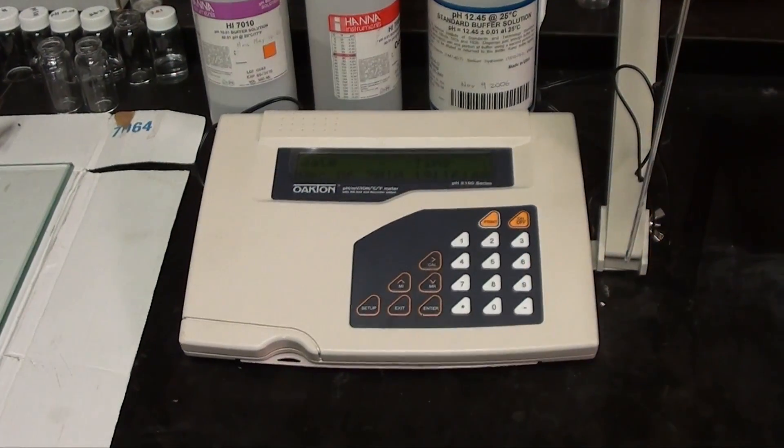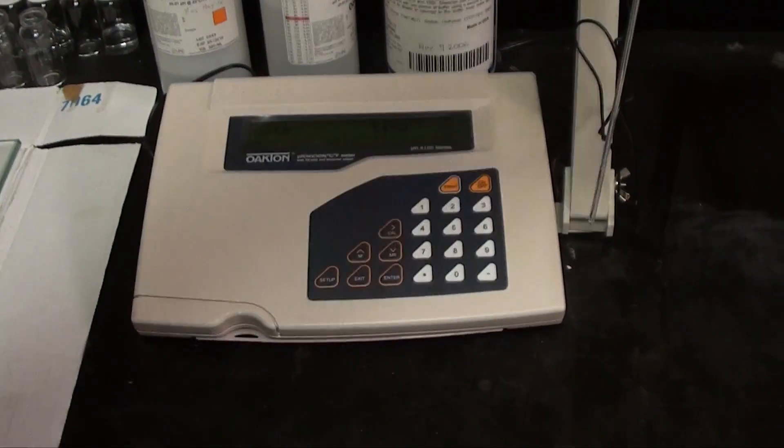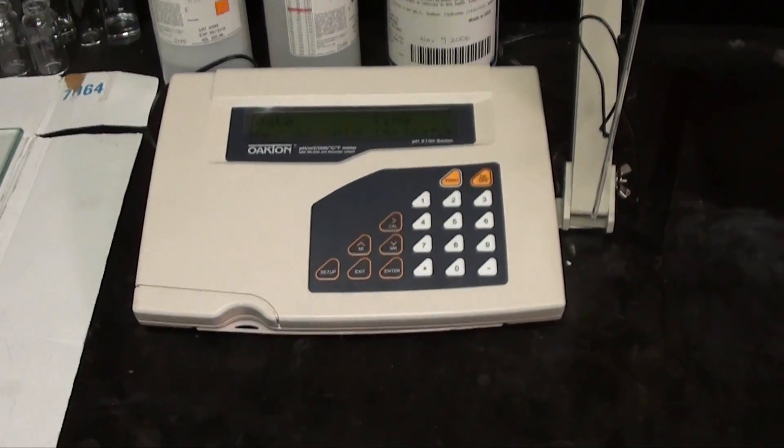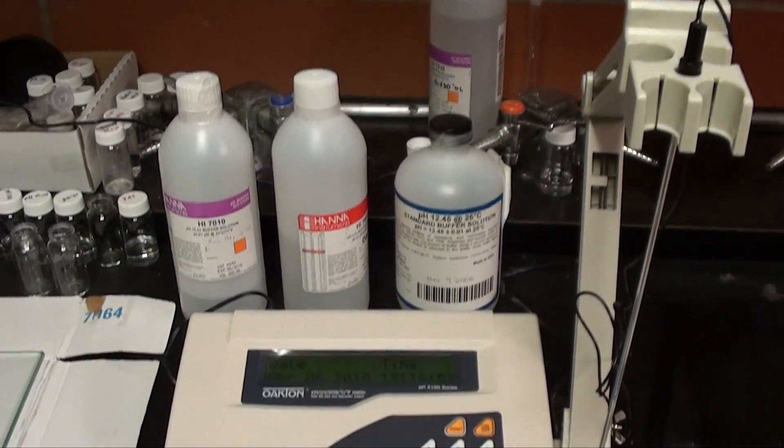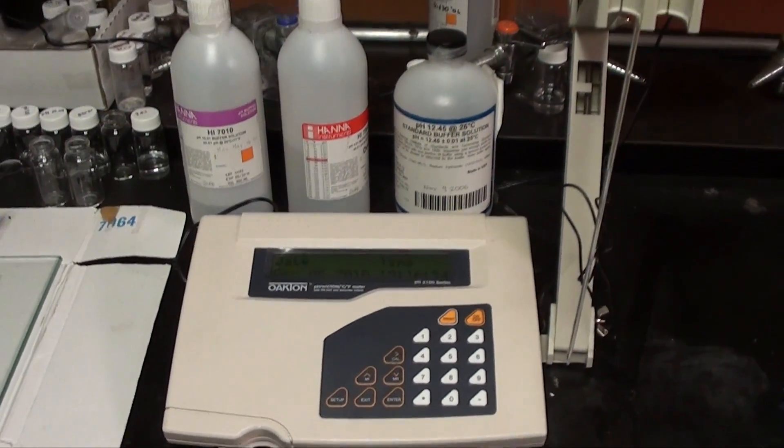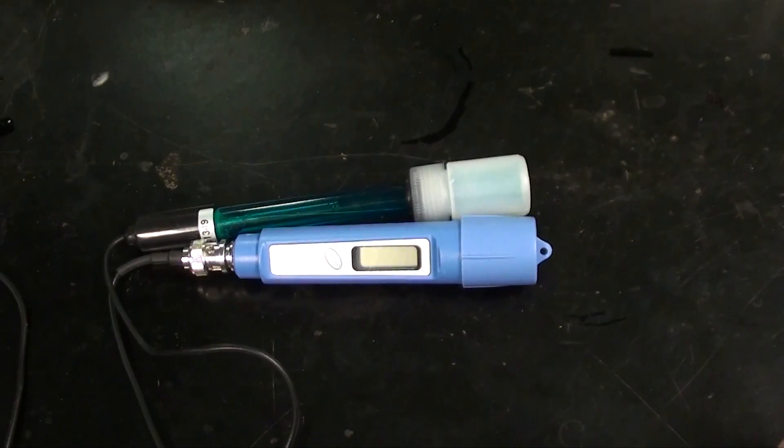For even greater precision, an expensive but high tech solution is to use a pH meter. I got this expensive laboratory model but you can get cheaper ones off eBay for about $40. It's not as good as lab grade stuff but it's still very usable.